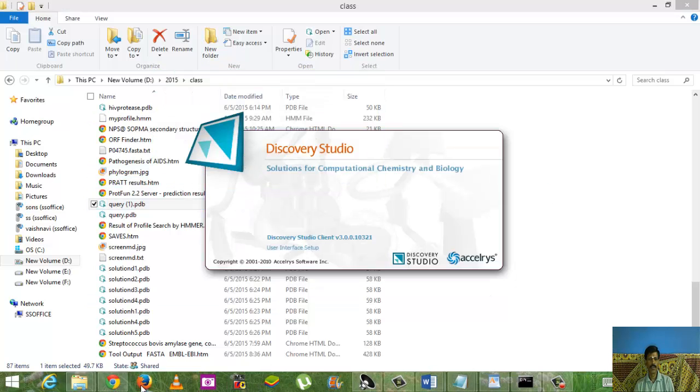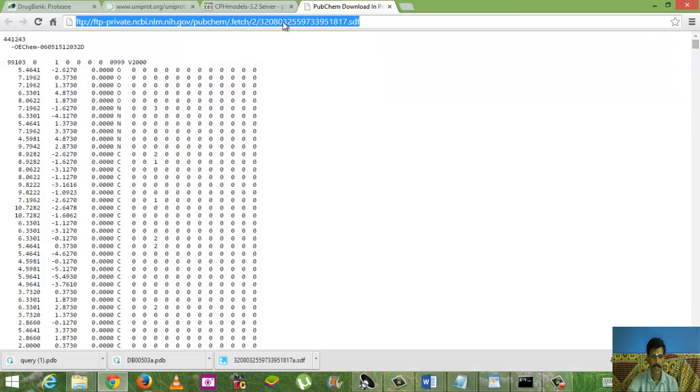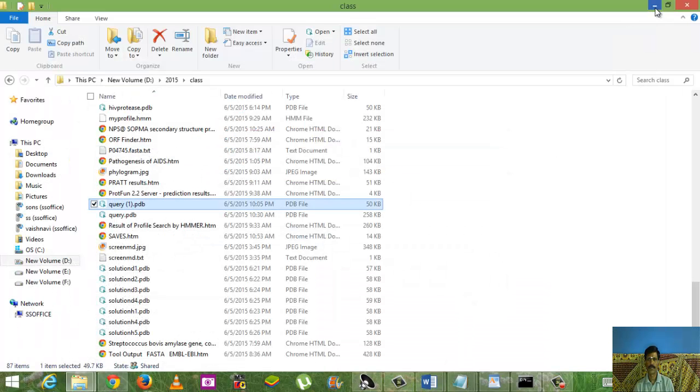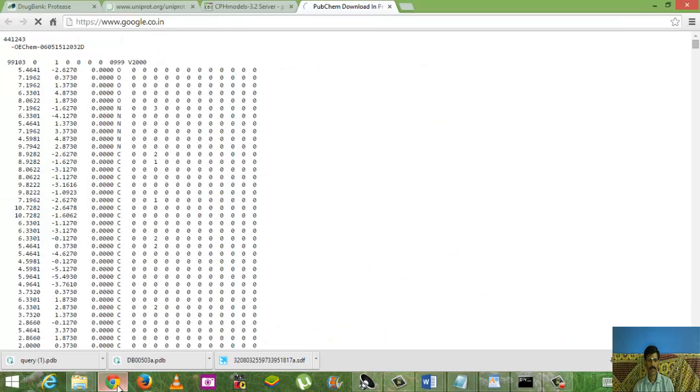In the meantime, we will go to the server for docking. That is, we prefer to go to the PatchDock server. It's taking a little time.